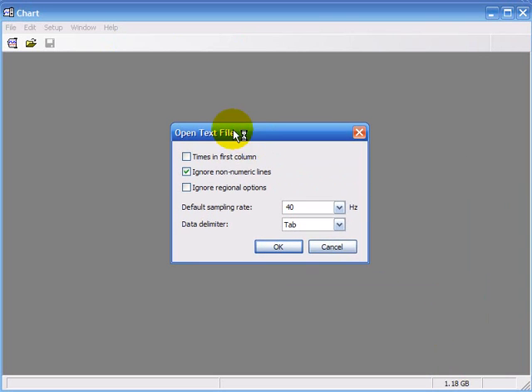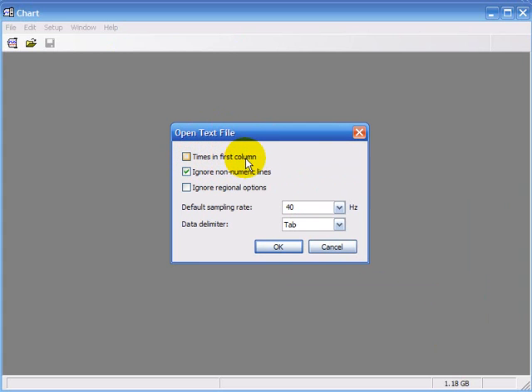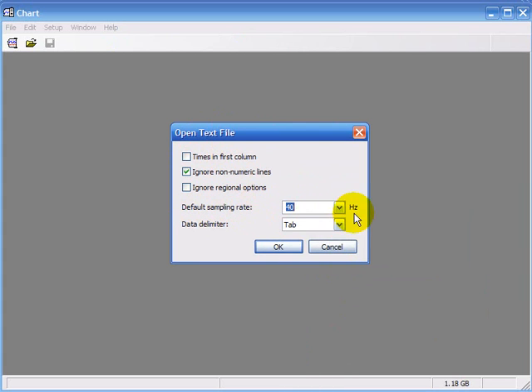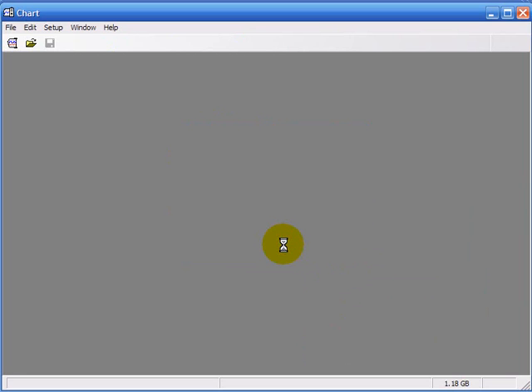This open text column will come up. You've got to make sure that you've unchecked the times in the first column. And the default sampling speed is what we found earlier on, the 40Hz. Click OK.